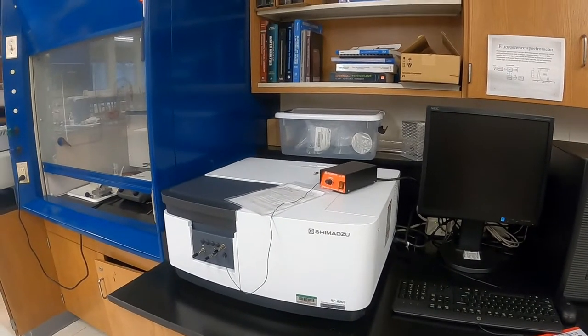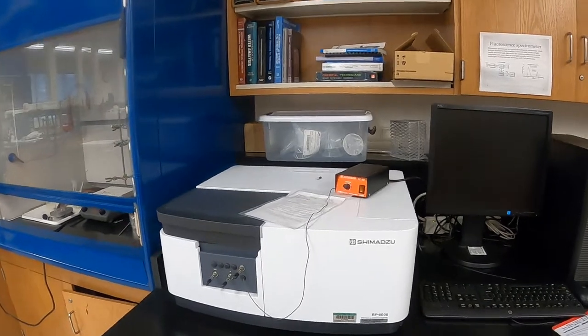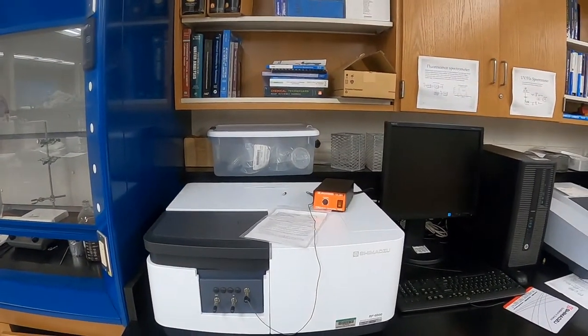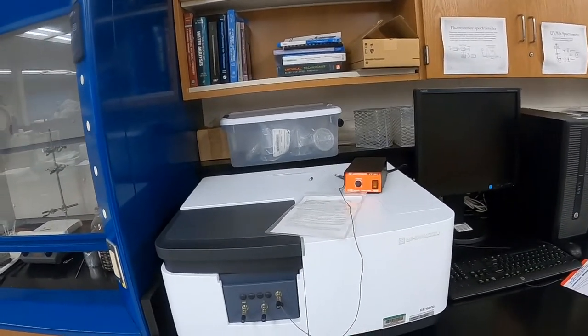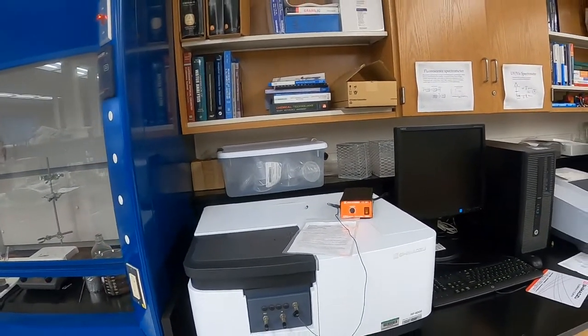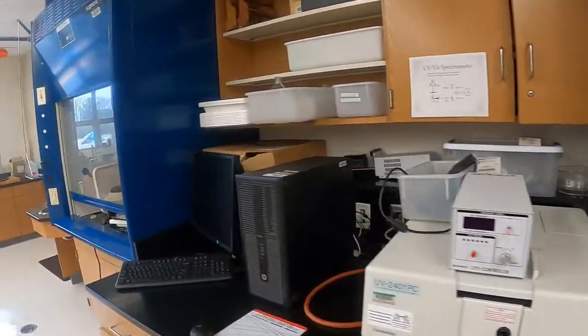And here we have what's called a fluorescent spectrometer, which measures the fluorescent properties of molecules, which is used quite a bit in projects related to nanochemistry, nanotechnology. Some students have begun doing projects related to studying the interaction of nanoparticles in a neuroscience type manner.